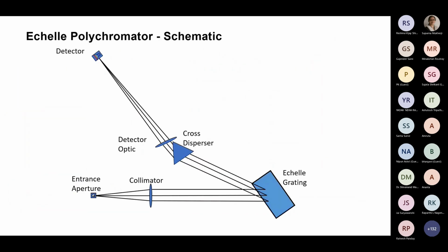So today, ICP-OES commonly uses echelle optical systems, which were originally developed and used for applications in astronomy, since despite their compact design, high resolution and a broad wavelength range are really the main characteristics. They typically use a rather low ruling density grating. The ruled grating is placed, optimized for higher incidence angles. And for this reason, it can be used at higher diffraction orders.